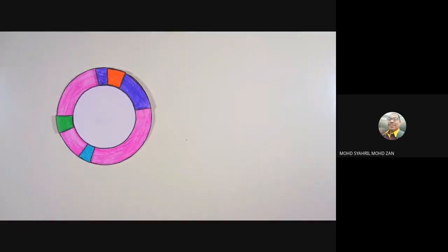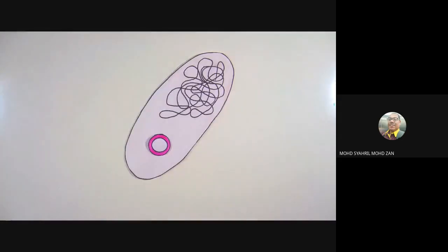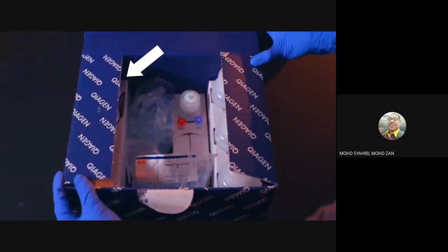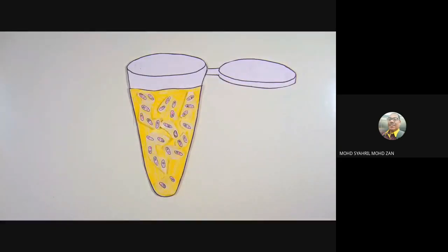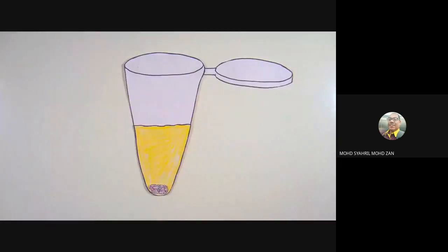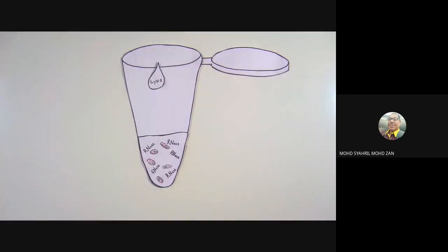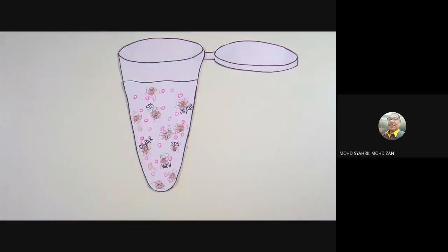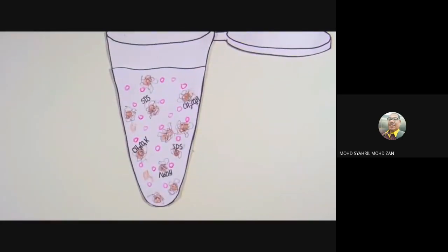of interest. In order to extract plasmid DNA from bacteria, biologists use a plasmid isolation kit, sometimes called a plasmid mini-prep kit. This kit consists of a variety of buffers and a column that binds to the plasmid DNA to purify it. Biologists begin with an overnight liquid culture of transformed bacteria carrying the desired plasmid. First, they separate the bacterial cells from the liquid media. Then they resuspend the cells in a resuspension buffer and lyse or break open the cells to release the plasmids with a lysis buffer. A neutralization buffer is added to precipitate cellular debris, but leave the plasmid DNA in solution.